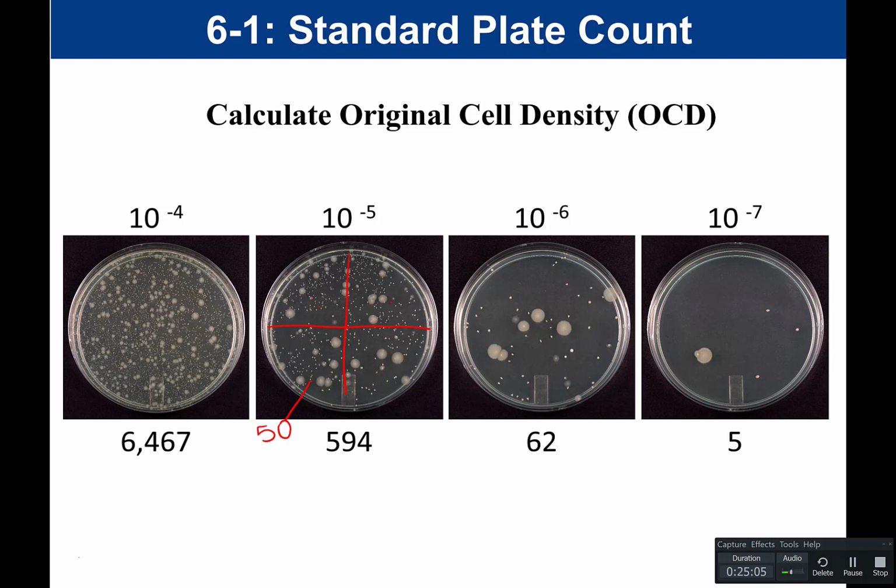I'm not going to open the plate and touch the agar. But on the bottom side of the plate, each time I count a colony, I would mark that colony so that I know that I've already counted it. That way you keep track of which colonies have already been counted. So that's just to give you an idea of how you would count these colonies.